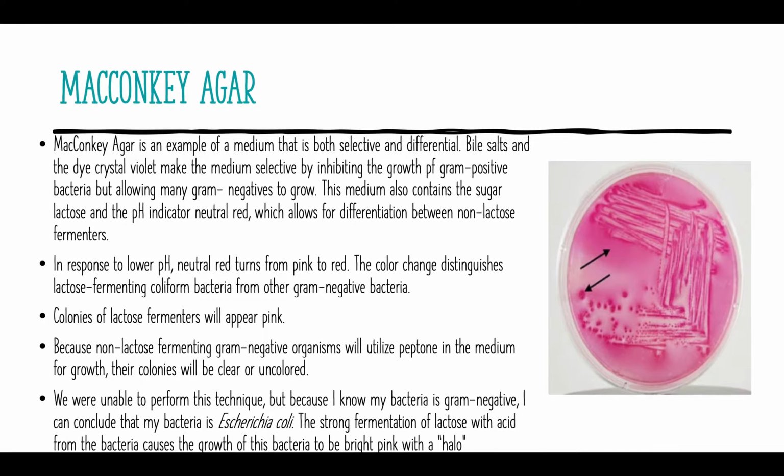And I knew my bacteria was gram-negative from one of the first tests, so I knew that it had to be one of the organisms that we tested that was gram-negative. So I assumed it was E. coli because of the bright pink halo, which indicated that there was growth of the bacteria.